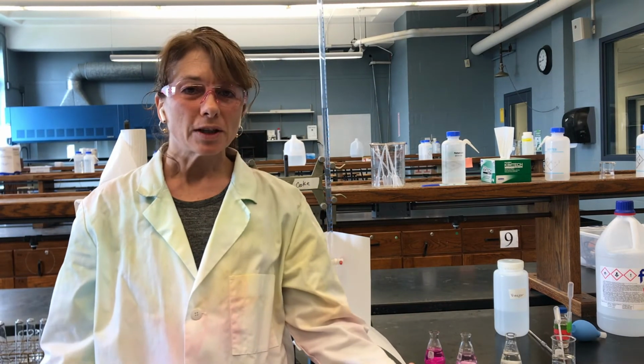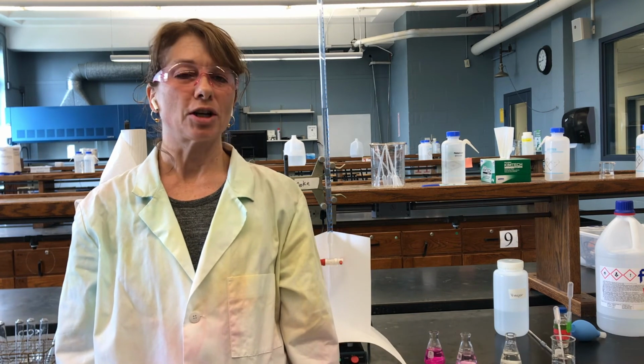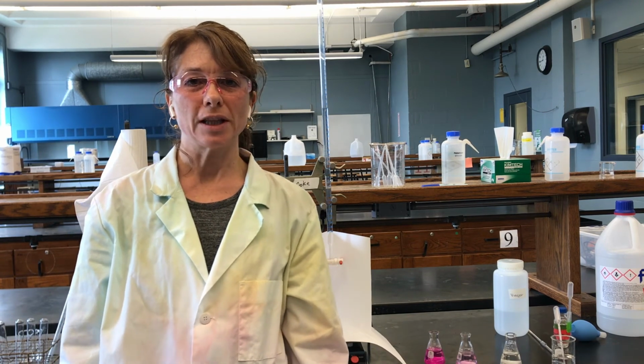So that's it. We're all done with the titration, and I'm going to clean up here, and then I'll meet you back to work on the calculations.